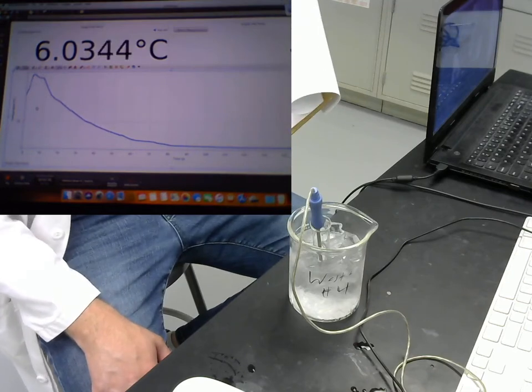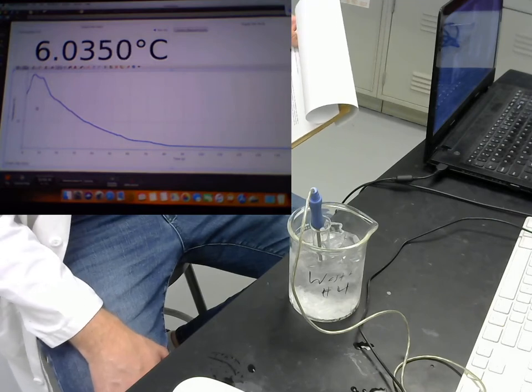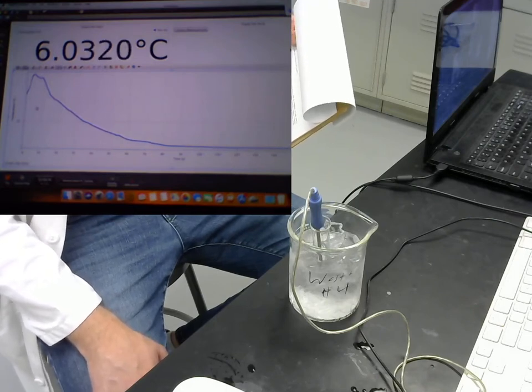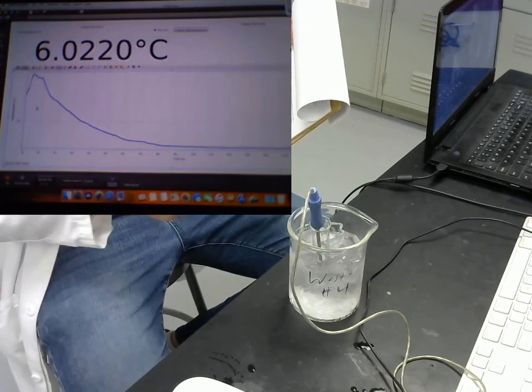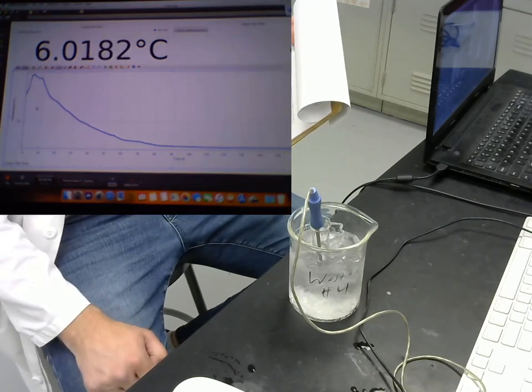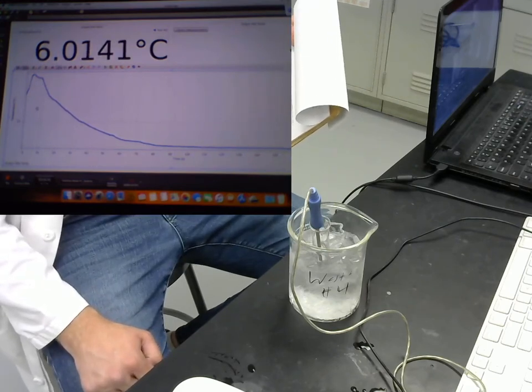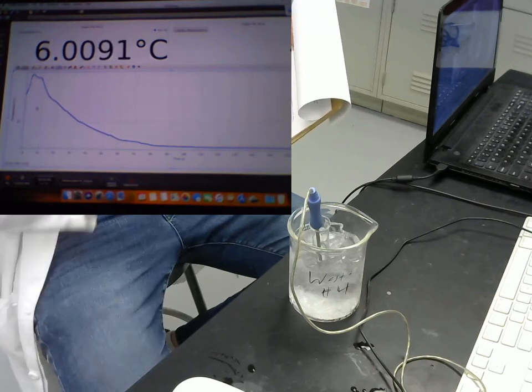You know what, based on how this looks, I'm going to guess that that first test tube actually had some contamination in it. And so let's throw out that first trial. And we'll actually warm this test tube up and run a second trial with this test tube as well, because frankly this looks a lot more like what I was expecting for a pure substance.